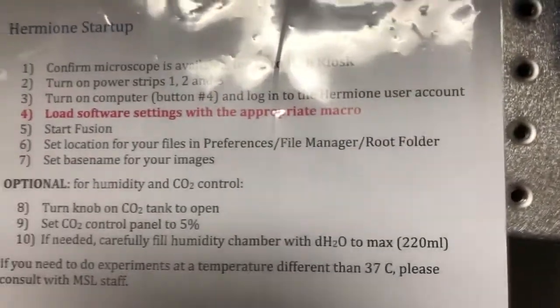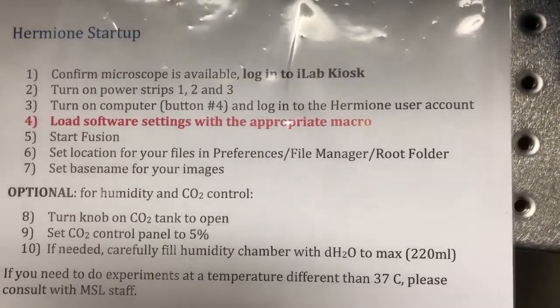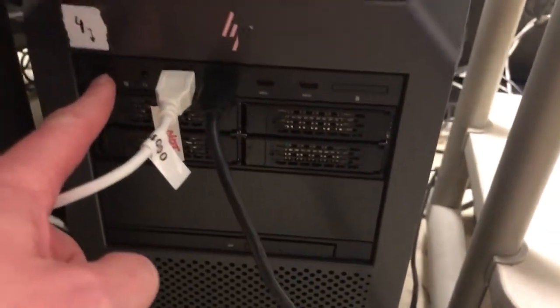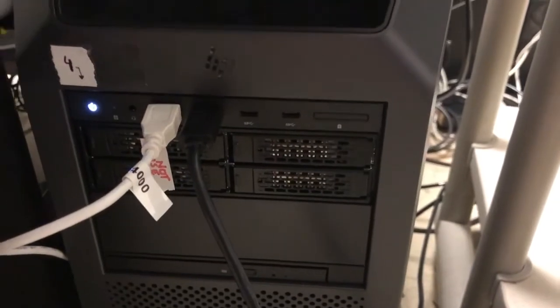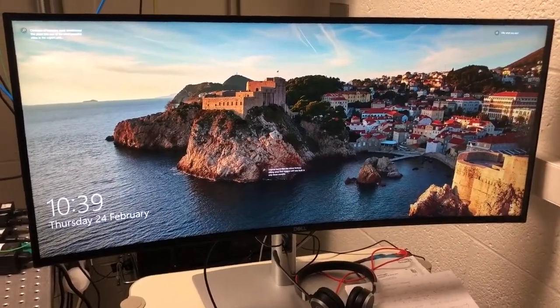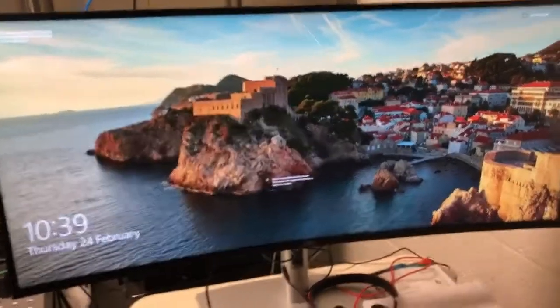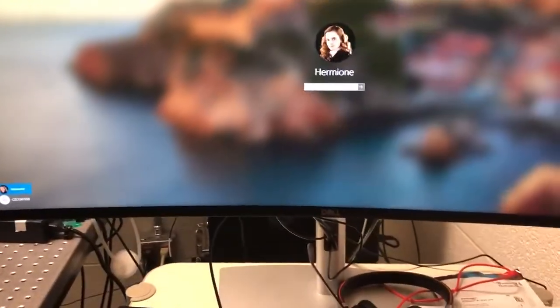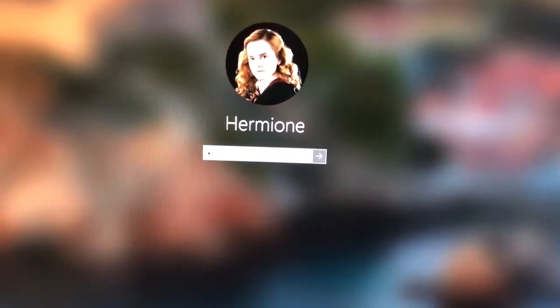The next step is to turn on the computer, which is button number four, and log into the Hermione user account. Button number four is down here — you can see it labeled. If I press that button, the computer will turn on. The computer can take a while to turn on. Once it is on, we are going to log in to the Hermione user account. The password as usual is 'msl', all lowercase.